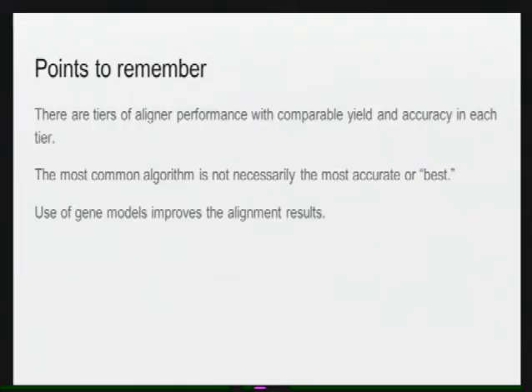You may cover this later, but do you have any preference for the study of variants, alternative splicing, or any variant alleles, instead of looking at the quantifications? Because alternative splicing or other alleles may be different than looking at the quantification. Oh, so do we have tools for analyzing the alternative splicing instead of quantitating?